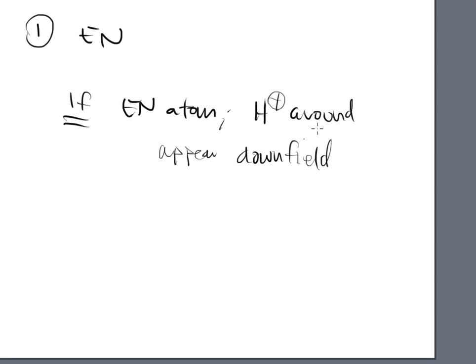How do I put a little bit of theory behind why this shift is located here for these protons, and then these protons give me a different signal, and these will be more upfield or these will be more downfield? How do I put a backing? How do I put an explanation behind all of it? Well, let's take a look.